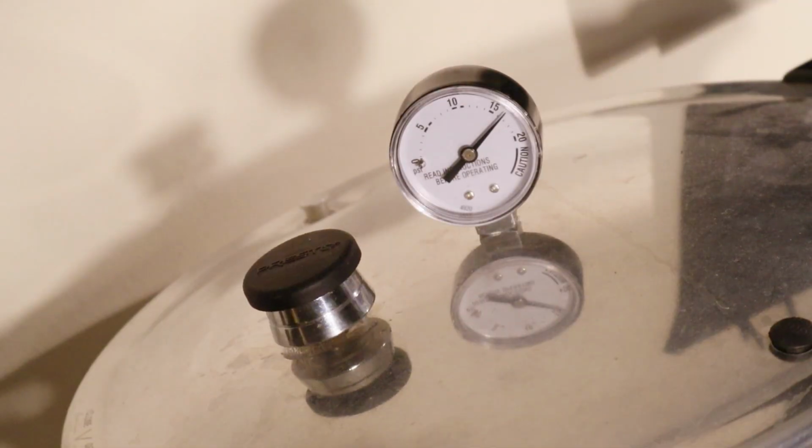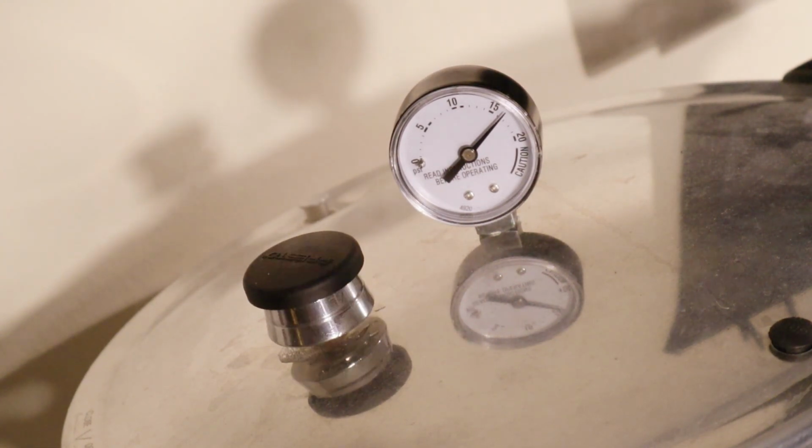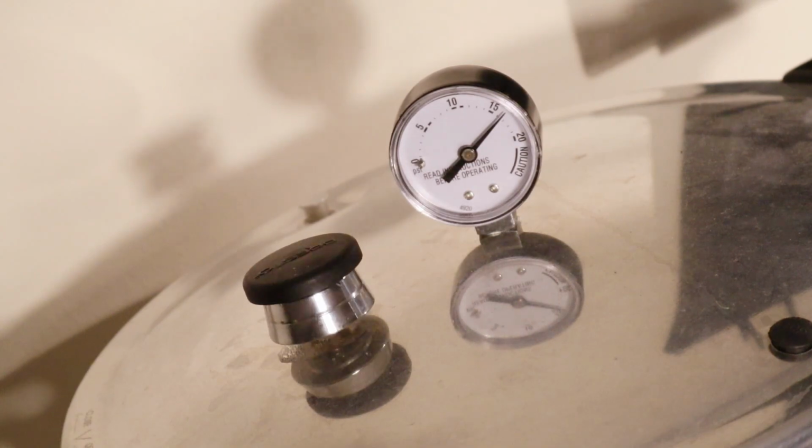I now had a liquid solution of Streptomyces agar, but it was contaminated with spores and microorganisms from the environment, and I needed to sterilize it. One method to do so is called autoclaving, which pressurizes steam to 15 psi to increase the boiling temperature of water to 121 degrees Celsius. After 15 minutes, this is enough to kill most microorganisms.